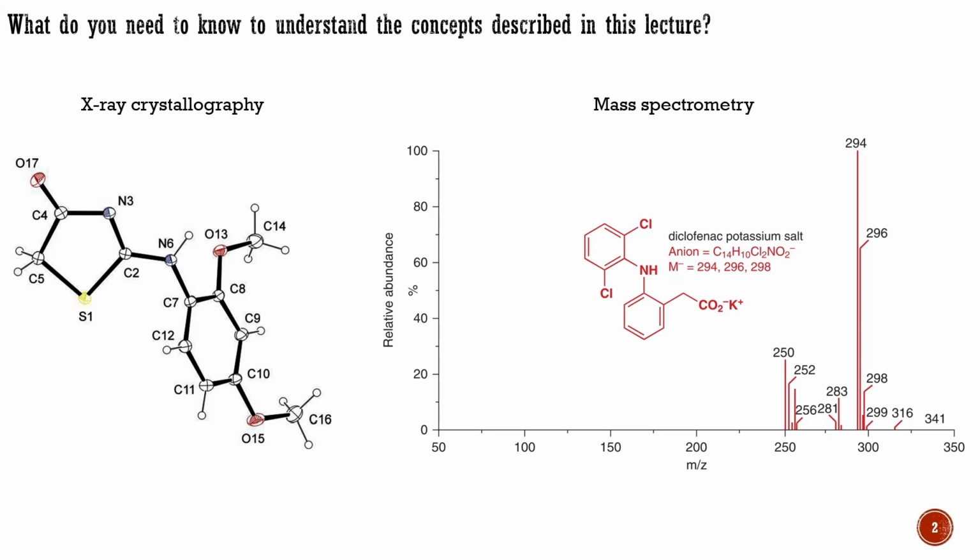In this lecture, my aim will be to give you a general introduction to the most important physico-chemical technique used to describe the structure of organic molecules. I am speaking about nuclear magnetic resonance spectroscopy, commonly abbreviated as NMR.